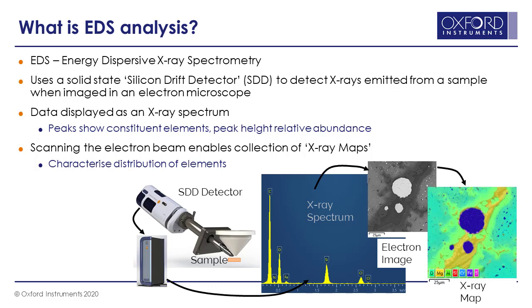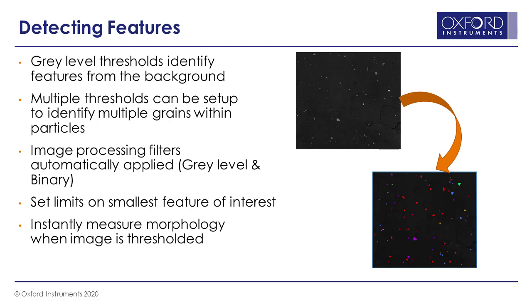We can also use electron images to detect features. Looking at a backscatter image from a sample containing particles, typically the particles have higher density than the background, so you see a black background with gray particles on it. If we threshold using gray level thresholds, we can easily segment the image to show only where there is a signal above background level — where we have our particles. We can set filters on the smallest particle size we want to detect, and then easily use that as a filter for where to go and collect the chemical information.